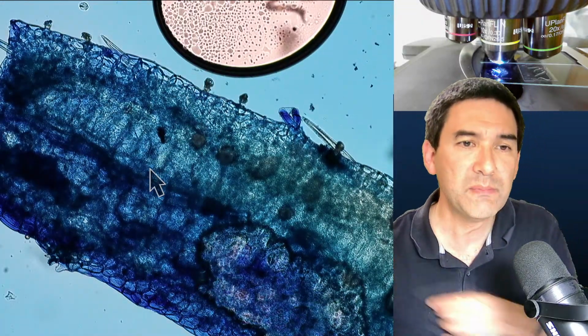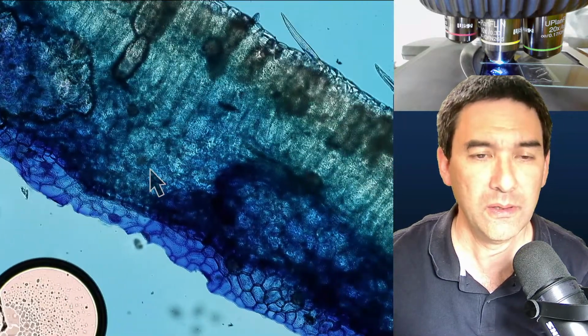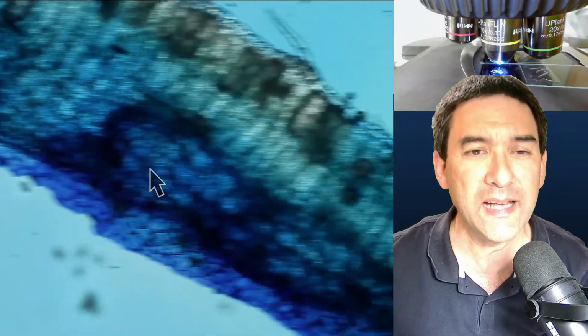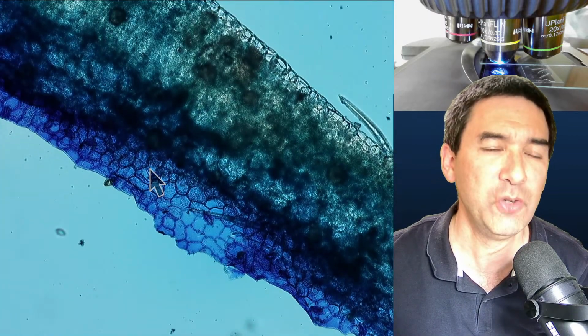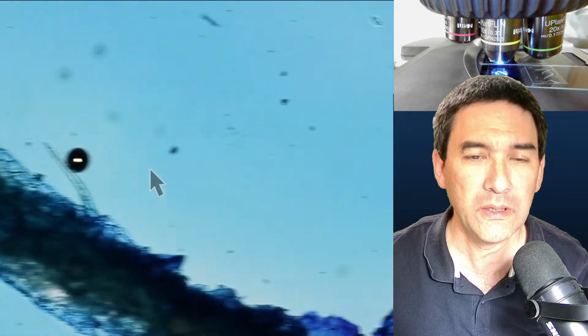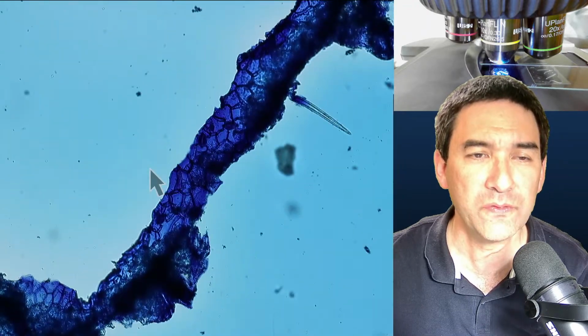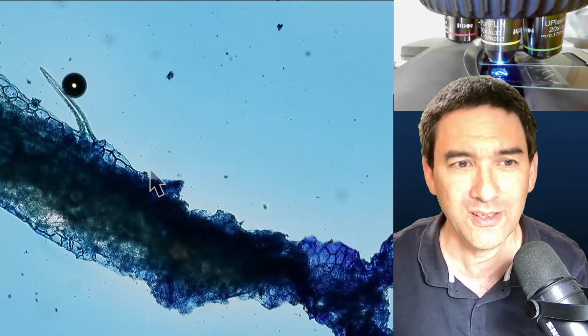So this methylene blue solution is a general purpose stain. In this case, I don't know if it really adds so much value, maybe the individual cells you see a bit better. Normally, you would like to make different parts of the cells better visible, but if it just stains everything uniformly, then there's not a lot of point here.